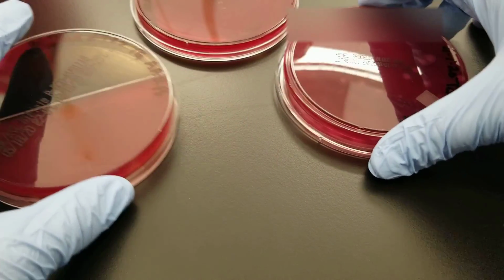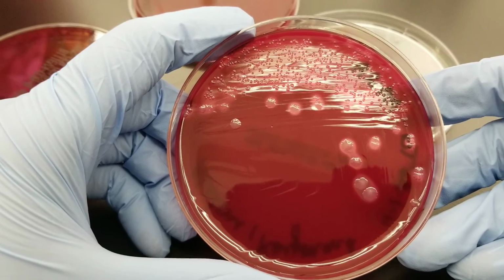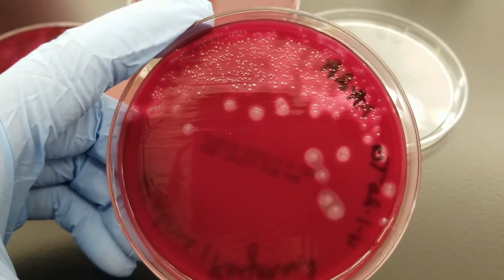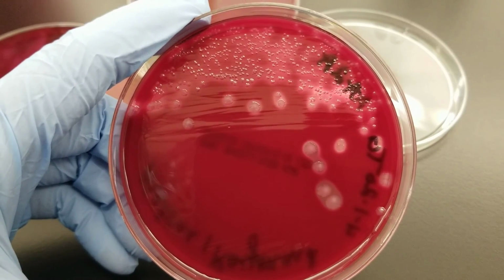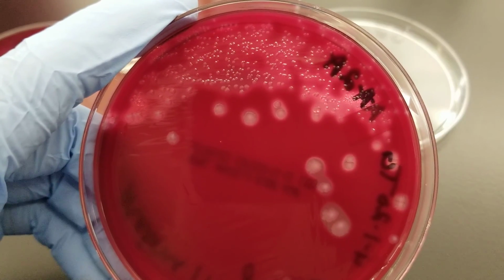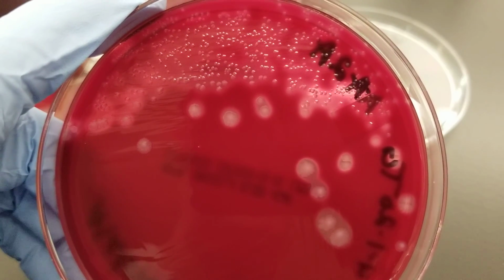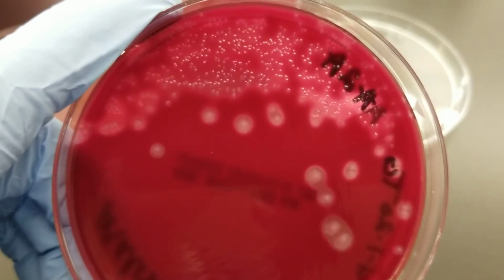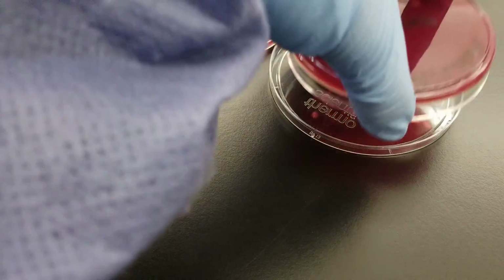So we have our Brucella blood agar plate. We have beautiful growth there. A lot of times when you have a mixed culture plate, you're going to want to use a magnifying glass. We have lamps in here that do have a magnifying glass on it with the light around it, because these grow slowly, so they would be kind of tiny depending on if they're slower growing ones or not. So you can see that this specimen is beta hemolytic, and it is growing on Brucella blood agar plate.